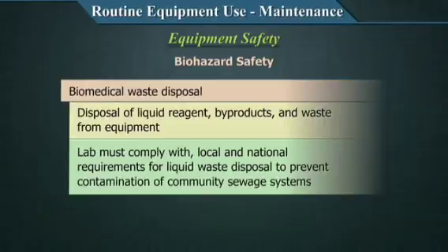So that's the next: effluent management. Management of liquid effluents is also a very important thing that we have to think through while we are operating our equipment in the lab. Now that we have talked about a few aspects of equipment safety, there are other aspects that we have not included in this discussion, but you can read more about it in the equipment management module and in the facility safety and management modules, which are also on this website.